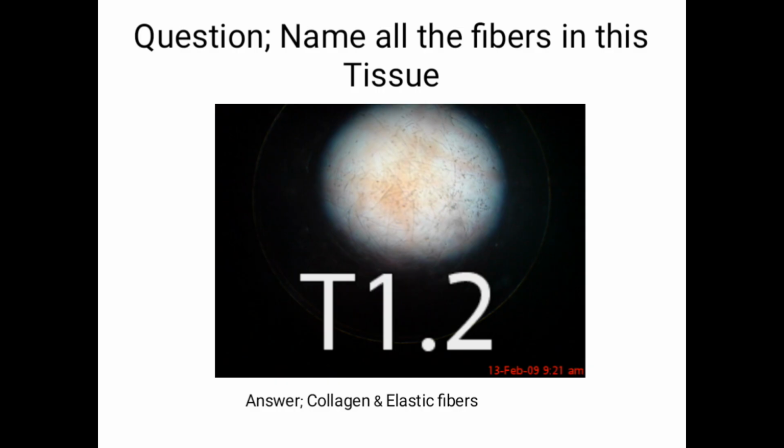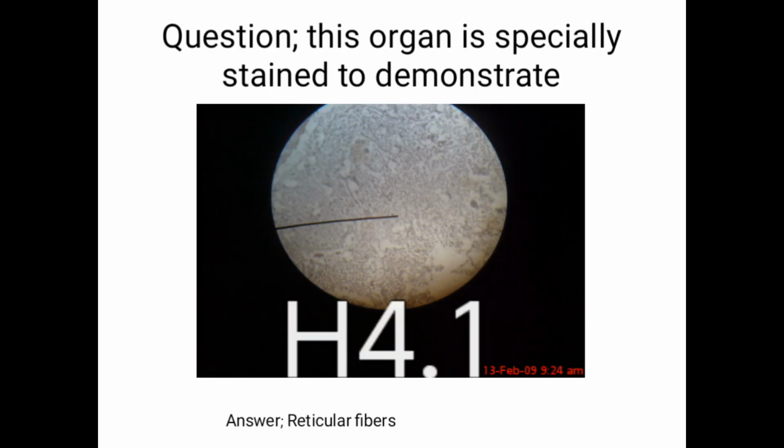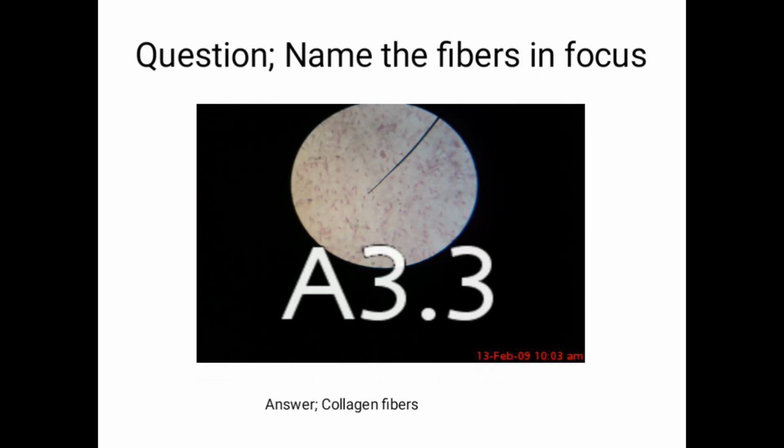Moving to muscle cells now. The first that you have here, okay, let's talk about reticular fiber. Reticular fiber has a fine branching network, and the best way to see it is when you stain it with silver. It has a mesh-like appearance, and that's what you can see, a mesh-like appearance. So this is collagen fiber.